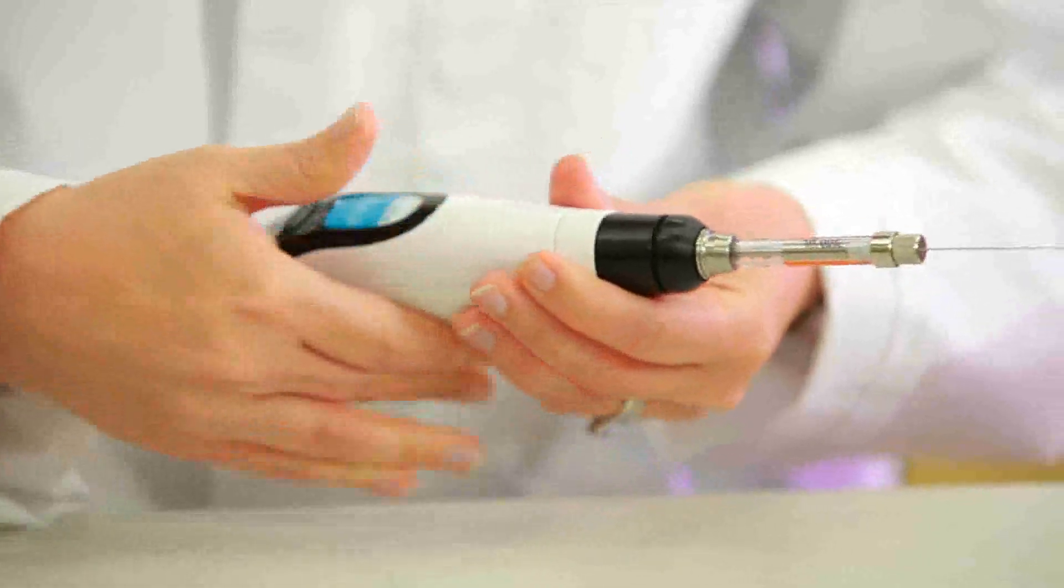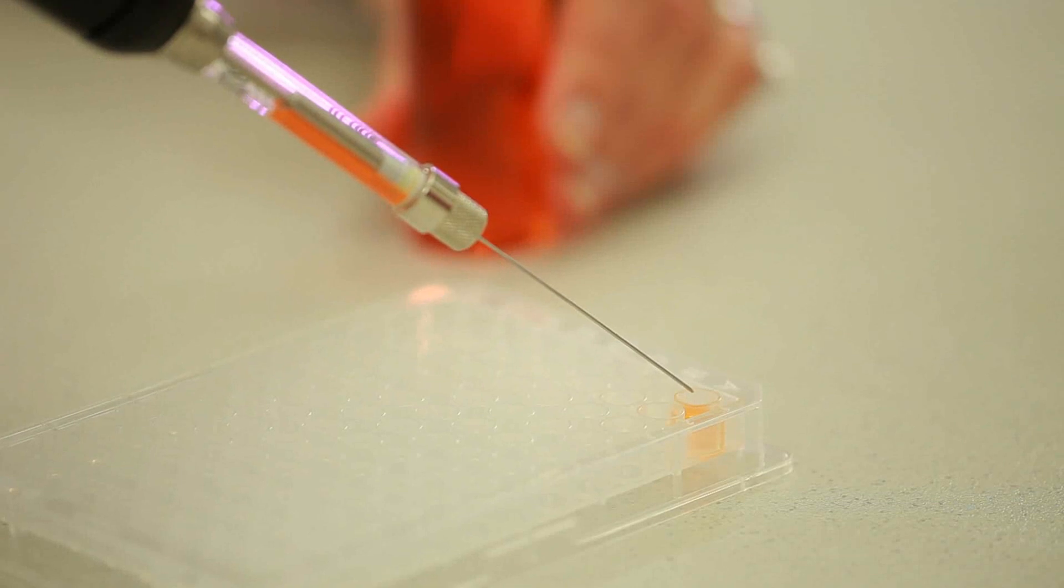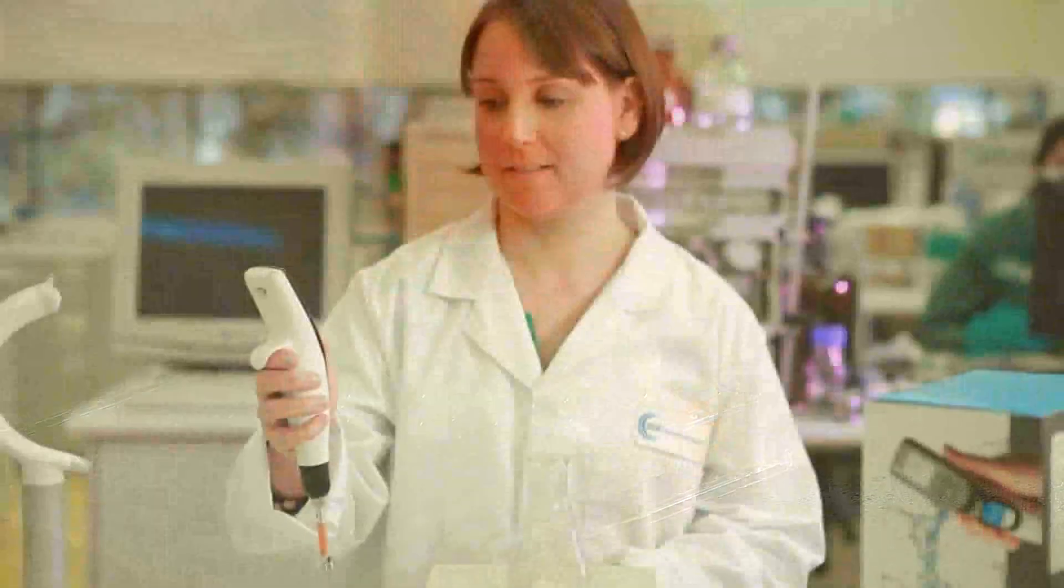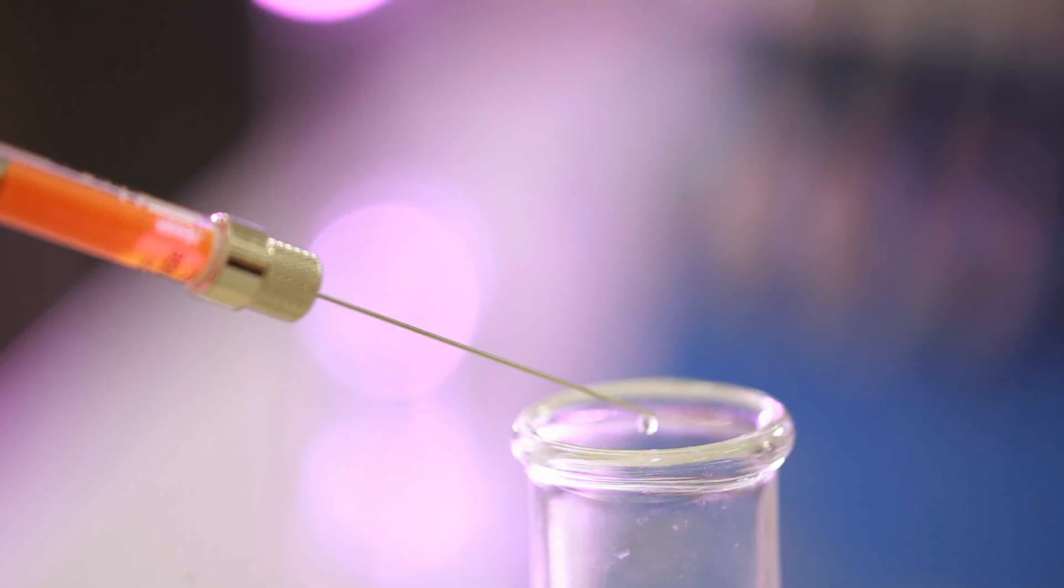The EVOL controls the speed and force of the injection volume, maintaining the accuracy of results regardless of the user. Titrations too are an easy process using EVOL. The EVOL can be set to release the drops at very slow speeds for hours at a time, a difficult task to complete manually.